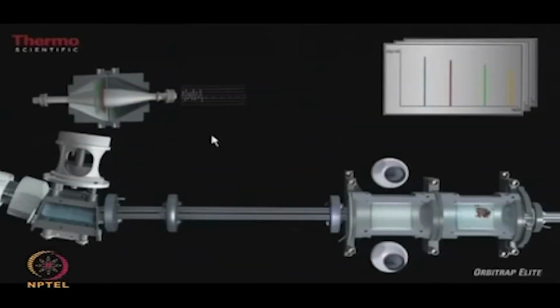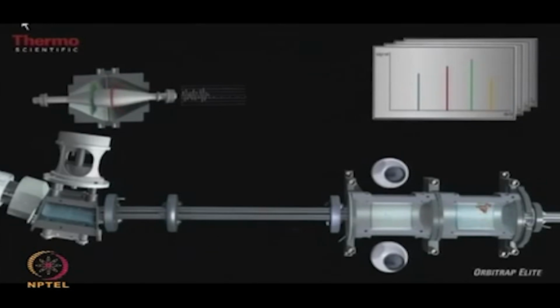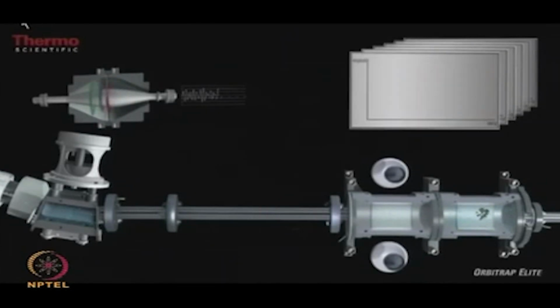If you want to work with the linear trap and the Orbitrap at the same time, you can run both at the same time. In the linear trap, the ions get stored and fragmented, and then are sent into the Orbitrap. So you can have the full scan MS as well as full scan MS/MS at the same time. In addition to the full scan MS and MS/MS, you can also have a low resolution scan from the linear trap. So this is what you can obtain from the Orbitrap.